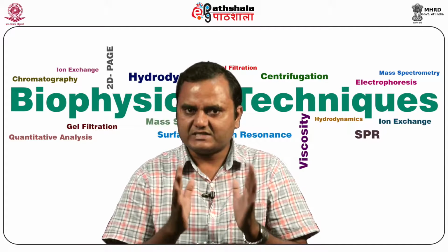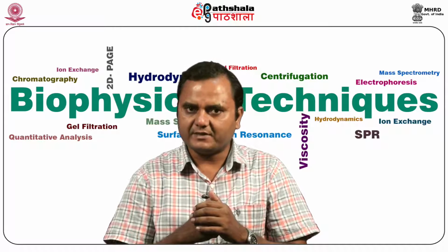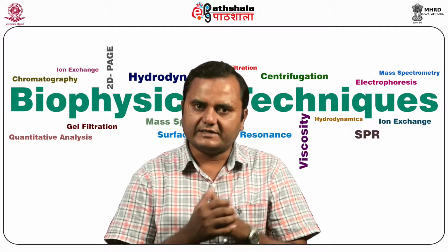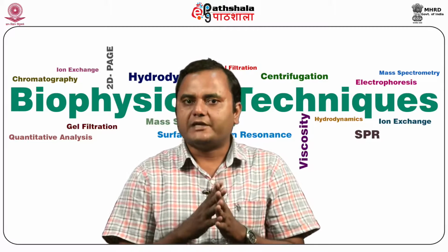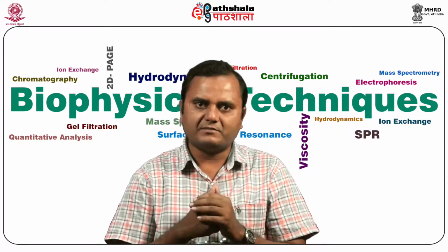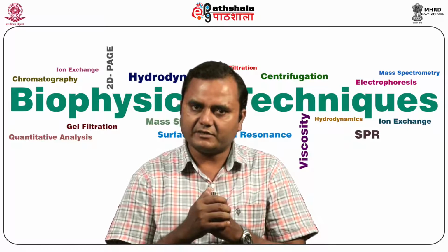But you must be sure that these factors are dependent on the temperature. So, the temperature should be taken into consideration, and at 20 degrees Celsius it is considered that the sedimentation coefficient value of 10 to the power minus 13 second is called 1 Svedberg unit, because this term was first given by Svedberg in 1940.